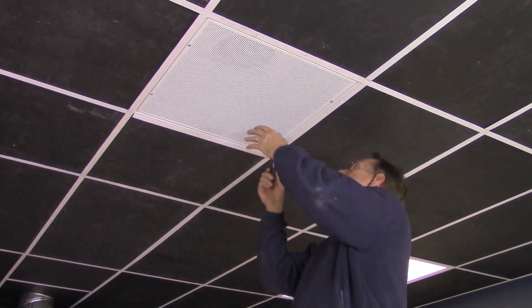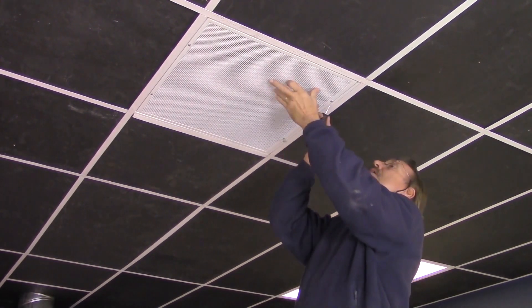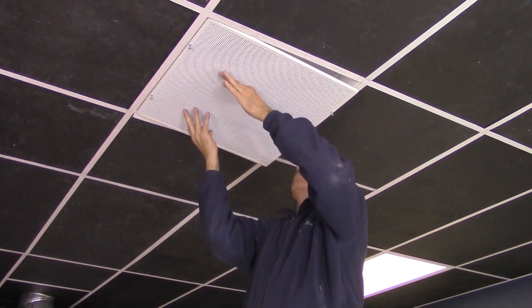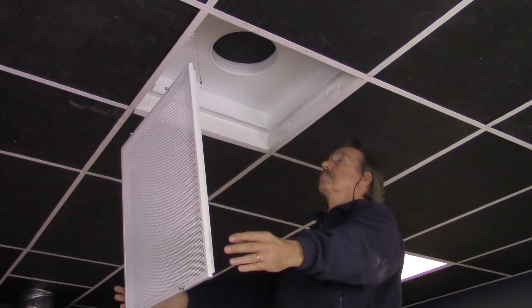Step 1. Locate the HPL-GS unit in the ceiling. Step 2. Use the short flat head screwdriver to release the quarter turn fasteners from the perforated faceplate. Slowly remove the faceplate from the HPL-GS unit, allowing it to suspend from the safety cables.